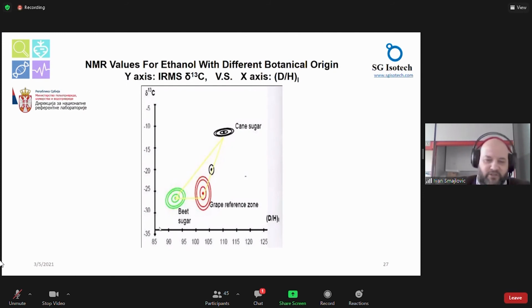Because of analytical parameters, for each method you have to calculate measurement uncertainty, which means that your analysis has some uncertainty. You have to calculate it and show it. This means that on the borders of this red cluster you have some measurement uncertainty. What if your sample drops here on the border? Is it okay or is it not okay? So you have this precision limit. It is not 100, but it is 98.5, the border for the red cluster. On the other side, it's not 96, but it is 97.5. So this free area here is not 3 or 4 ppm, it is actually 1 ppm.